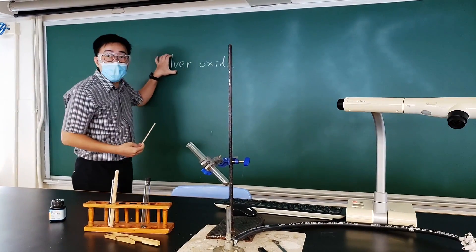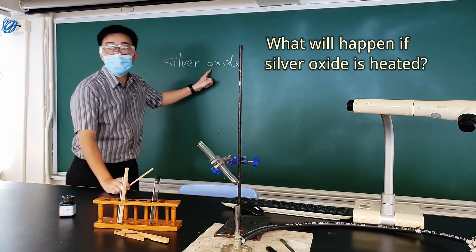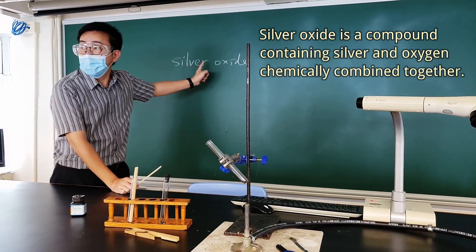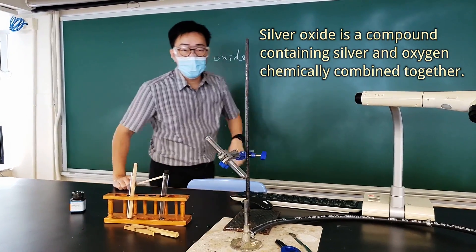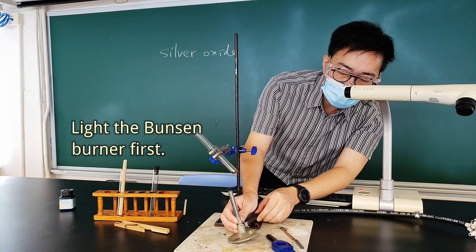I am now going to heat the silver oxide. Actually, we all know that silver oxide must contain oxygen inside, but it has been chemically combined with the silver to form a compound, being black in color. So I am to heat the silver oxide. Of course, first of all, I need to light the burner.